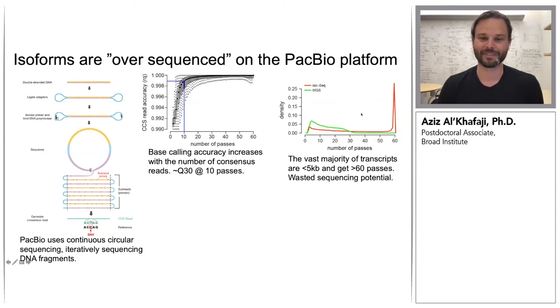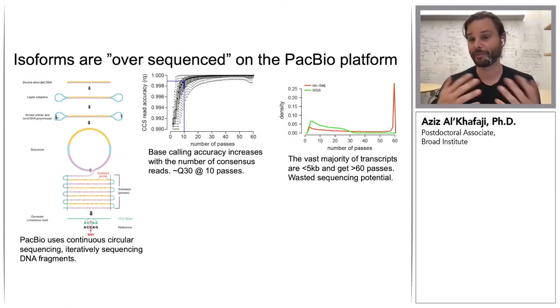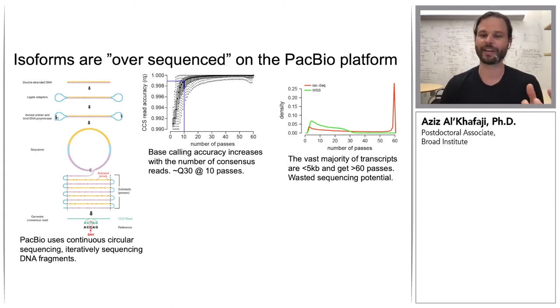Conversely, in whole genome sequencing on the PacBio instrument, they can modulate the size of their input libraries by shearing the genome, and they target 20 kb fragments. And this gives the optimal balance of both output and base calling accuracy. And so as you'll see here in the library, the pass number is somewhere around 10, or some below and a little above.